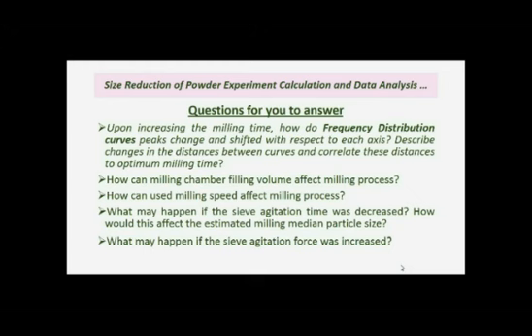What may happen if the sieve agitation force was increased? This will only affect particles, or friable particles, that are subjected to breakdown upon stronger agitation forces, which will lead to a smaller median particle size than expected.